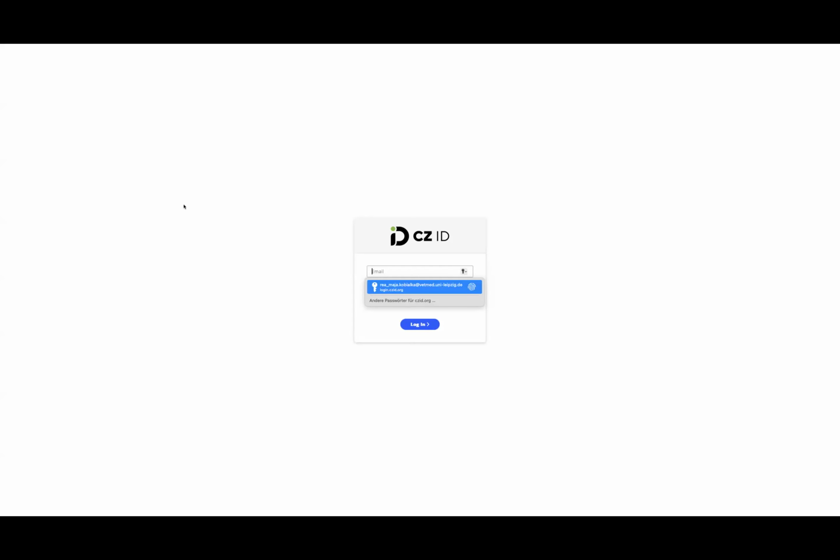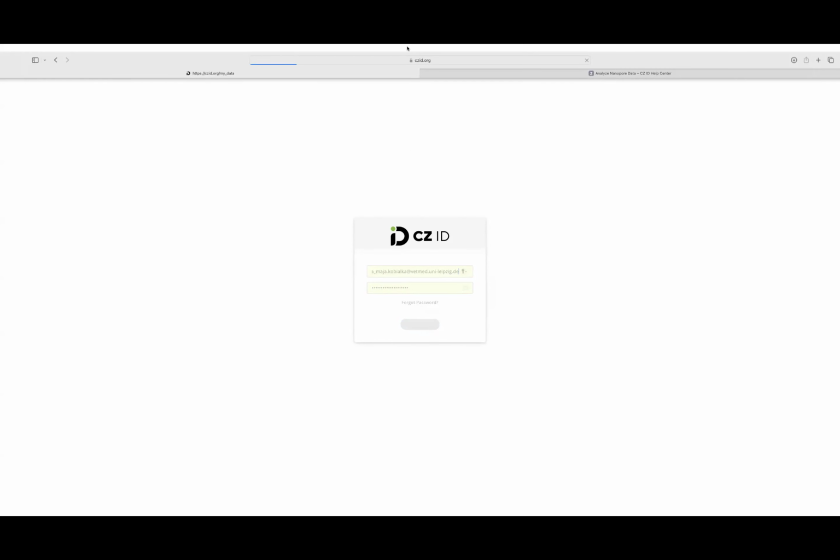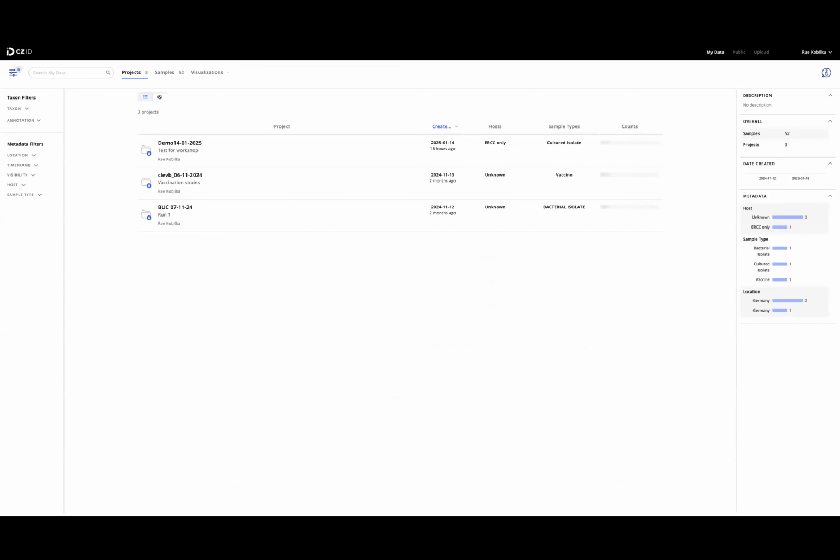Here we go. So when you go to the CZID website, you have to log in first. So I will quickly do that for my account. As I said before, it is free to sign up here. So it should be really easy for you, I think. Do you see my presentation or the Mark Zuckerberg? Nothing. Okay, perfect. Sorry, I was just confused about the presentation mode here.